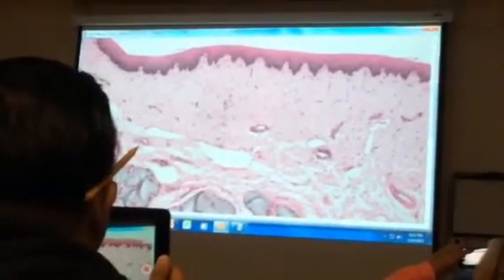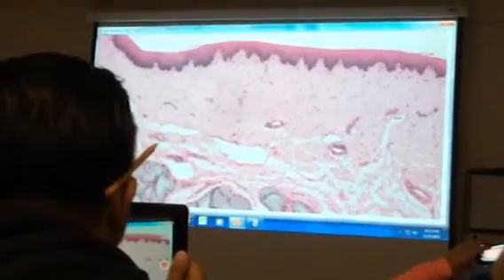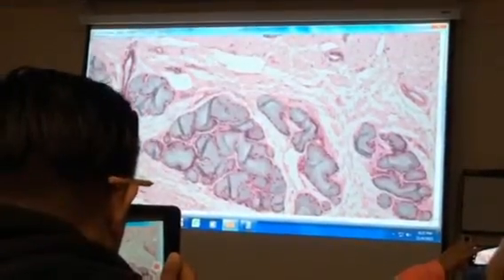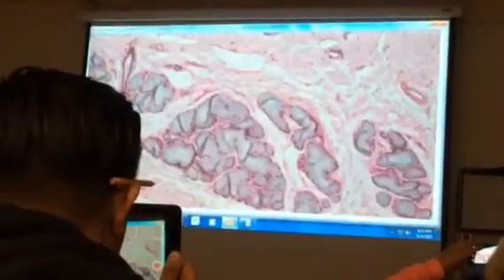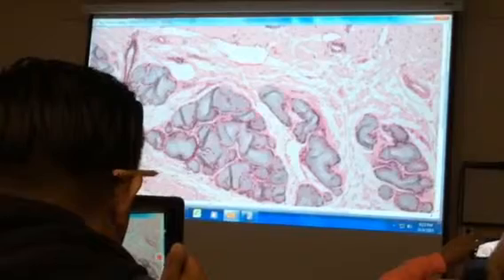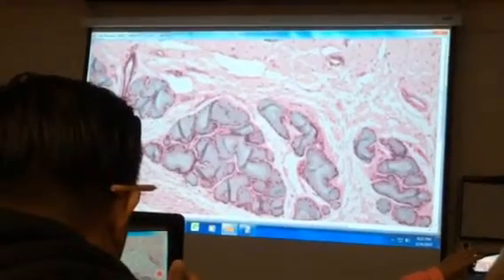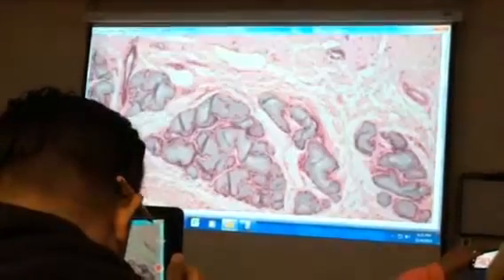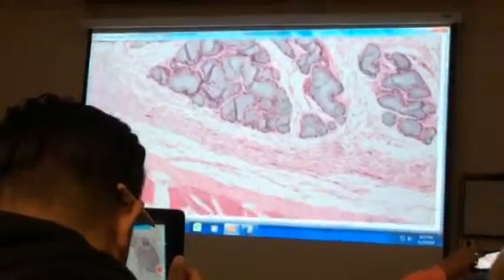Okay, so here, mucosa up to about right here. And then here, you can see it changes to dense, irregular connective tissue. Here's your submucosa, all of this. We've got some glands in here in the submucosa. What are those? Esophageal glands. Yeah, those are the ones that produce mucus. Okay, they're up at this section, the proximal section of the esophagus, the top section. So those are your esophageal glands. So that also tells you this is the esophagus.